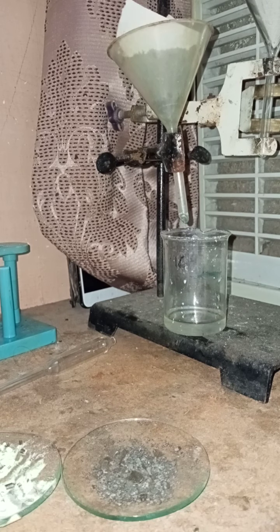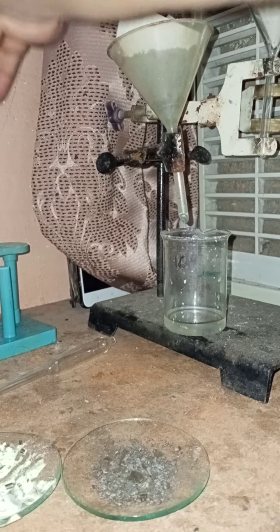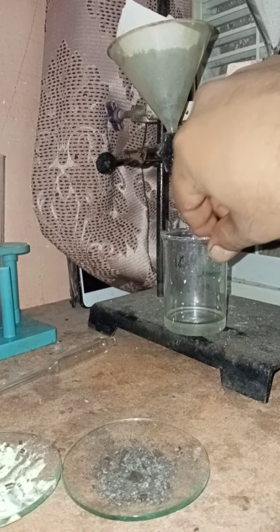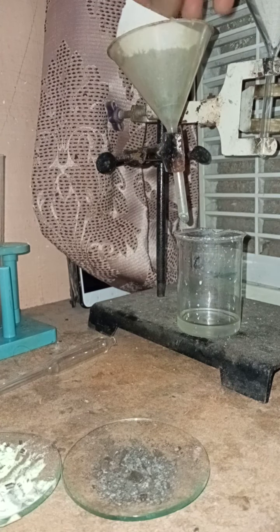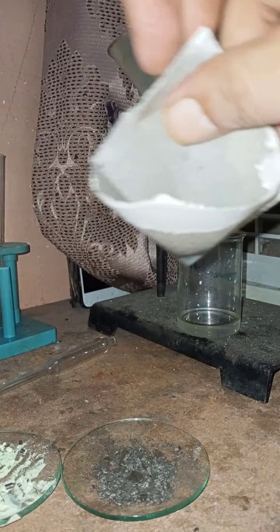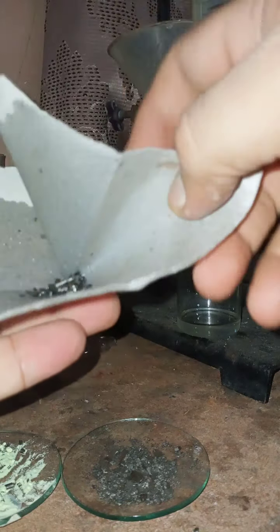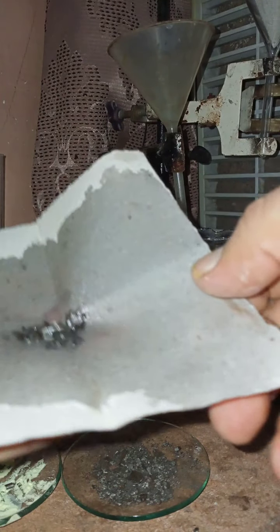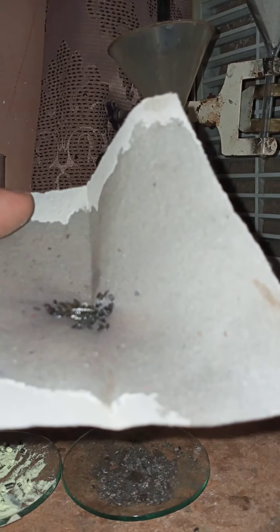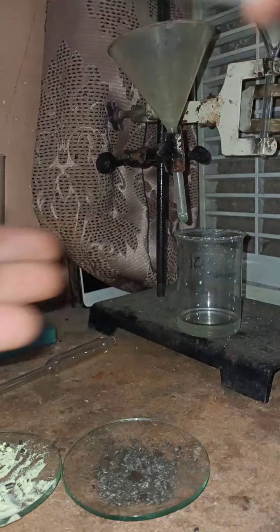You can see the filtration is going on. As the filtration takes place, here we have the carbon disulfide, and you can see here we have all the iron filings separated from the carbon disulfide. So by this process we can separate the iron filings and carbon disulfide from each other.